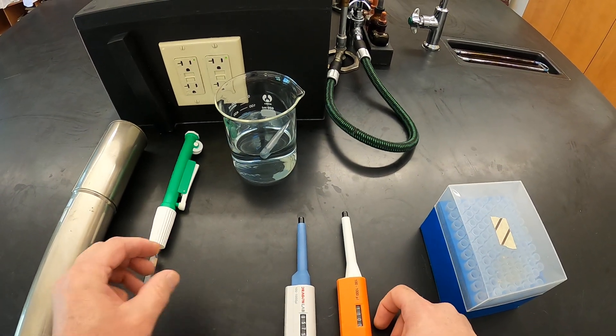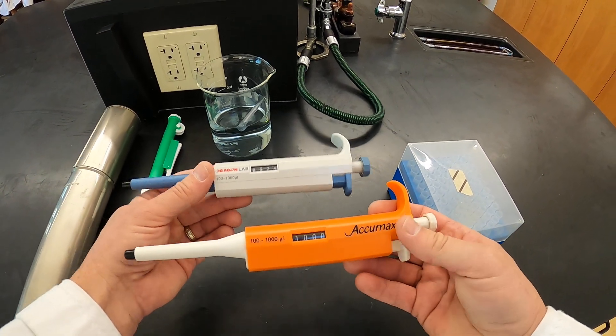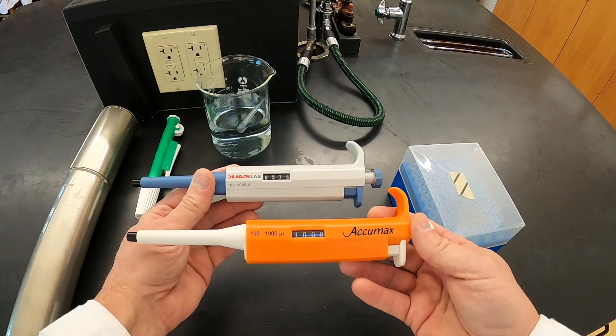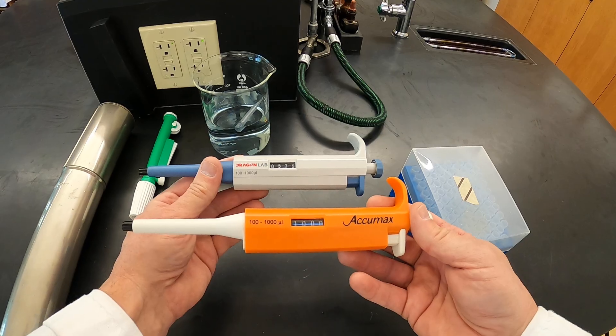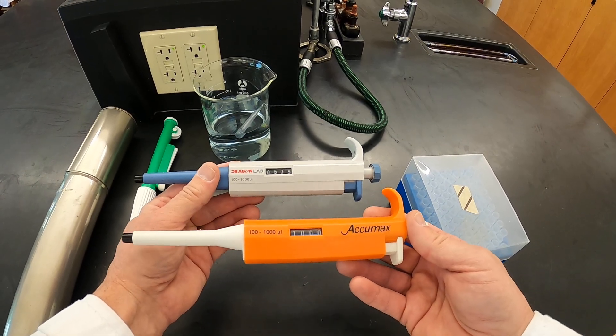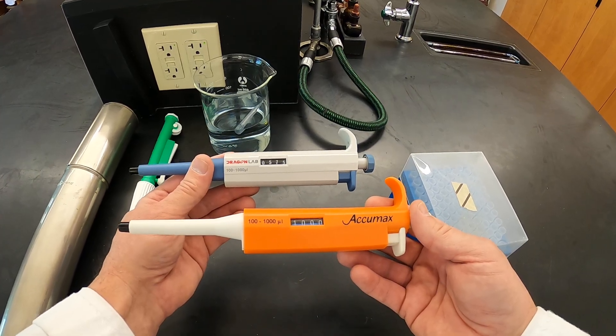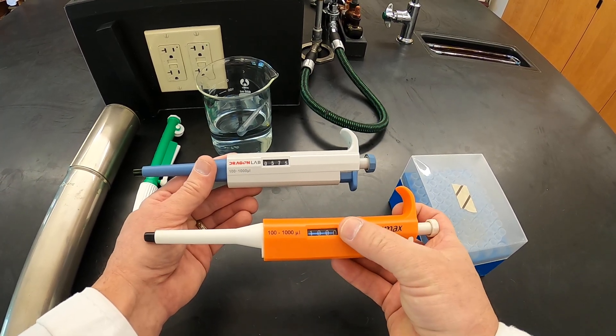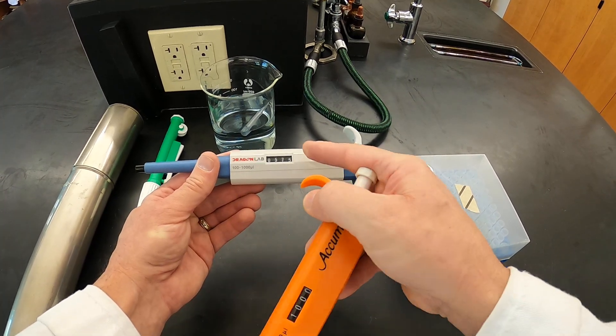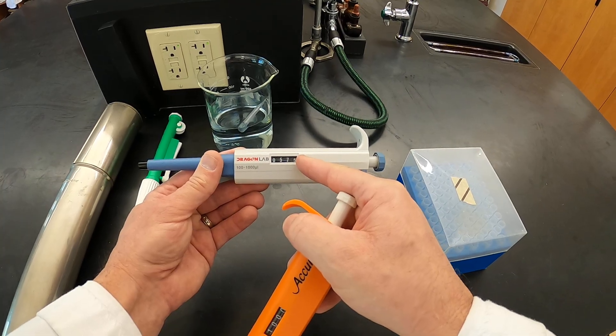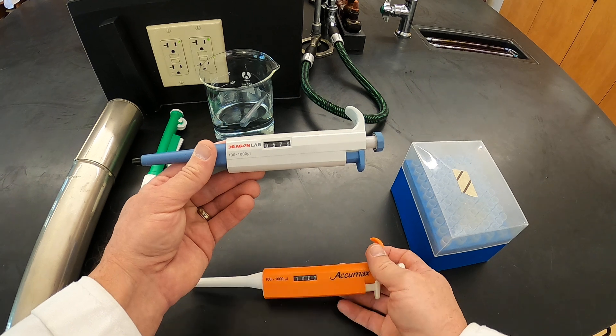So these two things right here are micropipettes. These two micropipettes are actually from different manufacturers, but they have the same functional range here, 100 to 1000 microliters. Now you may recall from our unit conversions that 1000 microliters is equivalent to one milliliter. So this one right here in the window is set to 1000 microliters or one milliliter. This one here is set to 575 microliters or a little bit more than half of a milliliter.